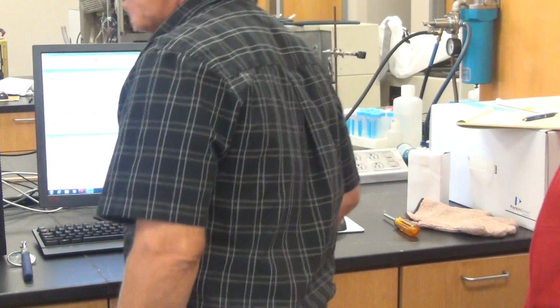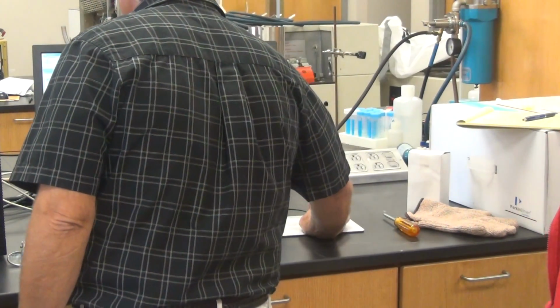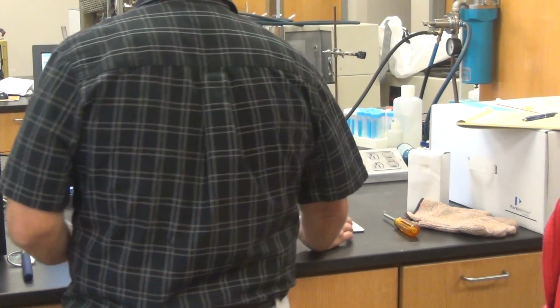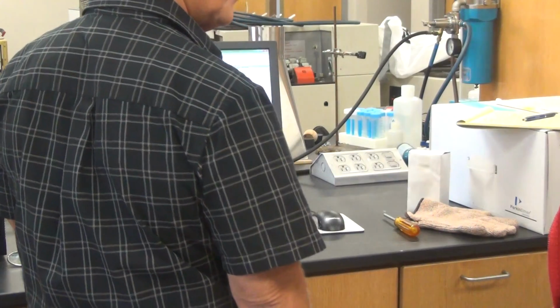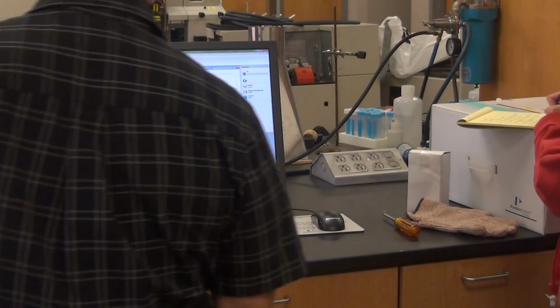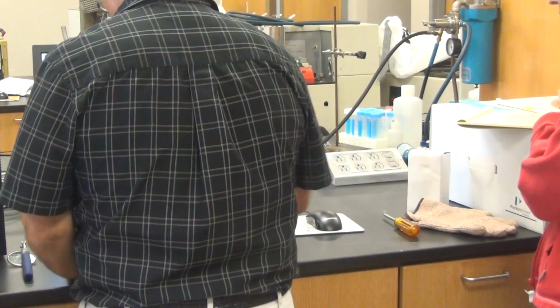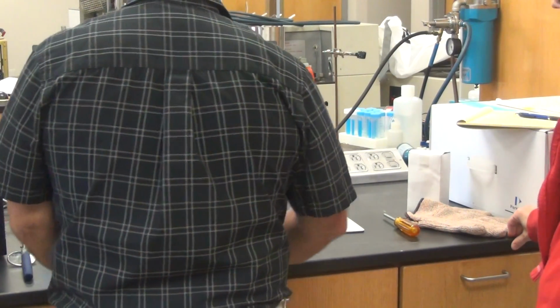So what we're going to do is, we didn't talk about align lamps. Instrument, we're going to go lamp setup. Well, it doesn't know what that lamp is in two. Thank you, two. Oh, that's right, because we got a non-coding one. So you have to go to align lamps, and you just click on the element and you say CR, hit enter, and it'll auto-populate.